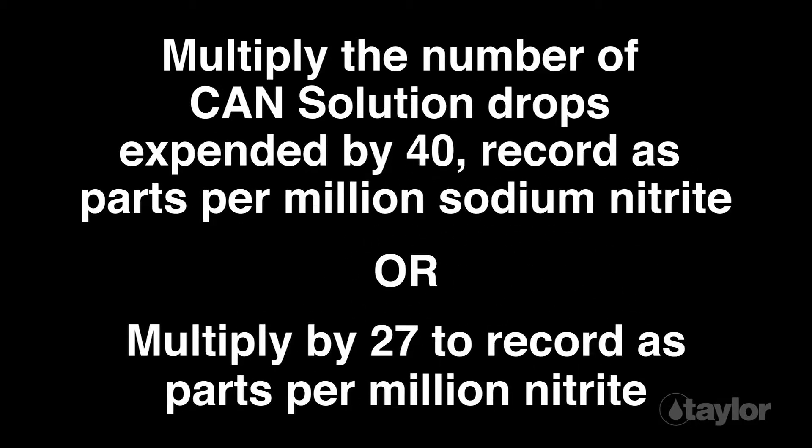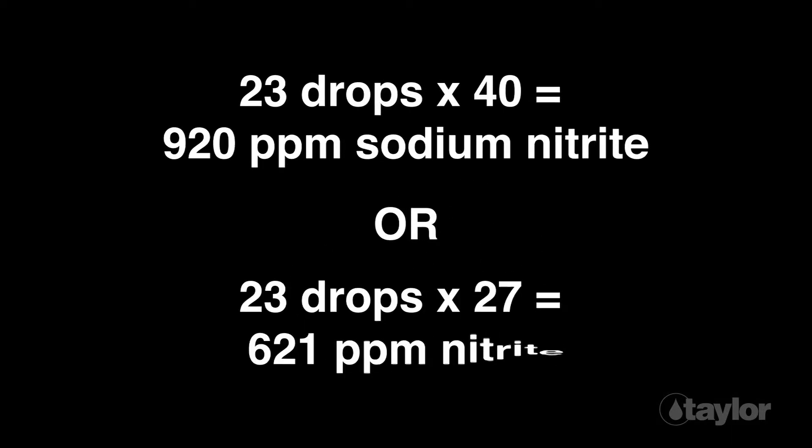Multiply the number of CAN solution drops expended by 40 and record as parts per million sodium nitrite. Or, multiply by 27 and record as parts per million nitrite. In this example, we used 23 drops, indicating a concentration of 920 ppm sodium nitrite or 621 ppm nitrite.